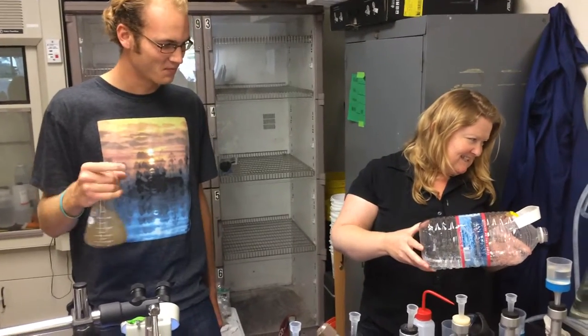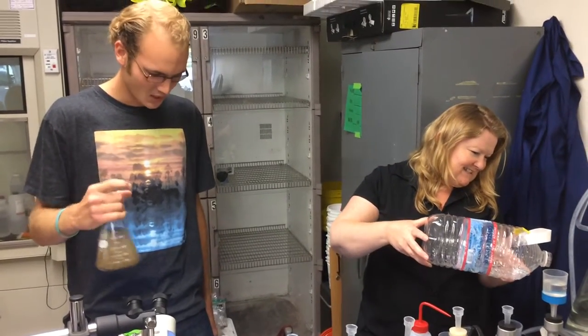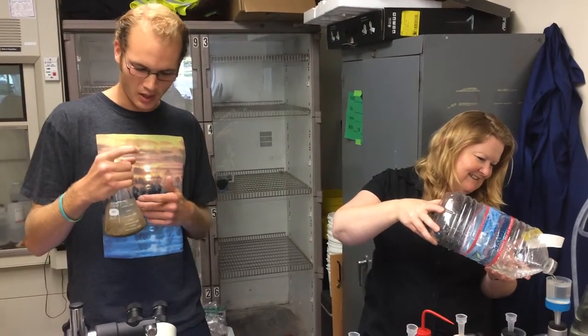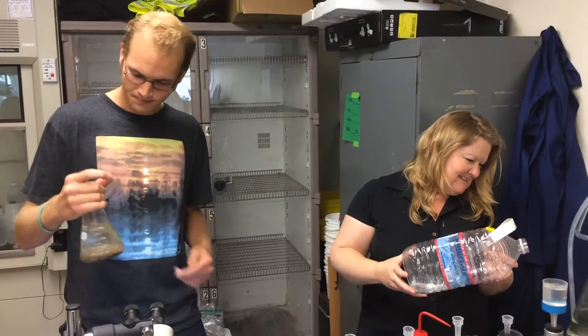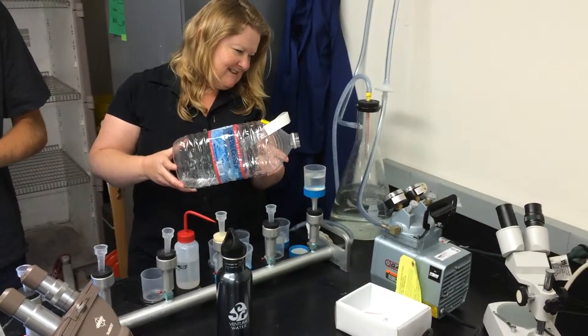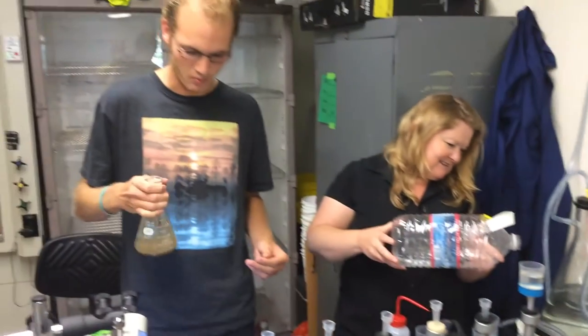What are you guys doing over there with pouring and swirling? So right now, we're floating microplastics in a hyper saline solution, and then we're running it through a filter. We are seeing how much microplastics and fibers there are going to be in each one of these sand samples that we grab from the beaches.